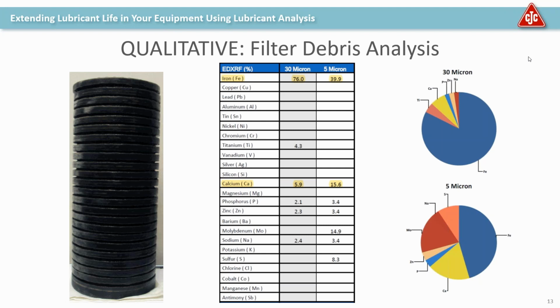You might start to see more metallic, mostly iron in the ICP, because it's going to be dissolved or corroded iron, so you might see iron oxides present on the ICP. That's the most common reason. Oxidation can occur for a number of reasons. It could be due to water present. It could be due to excessive heat. If you have a heating element in the system, you'll want to check for hot spots once in a while.